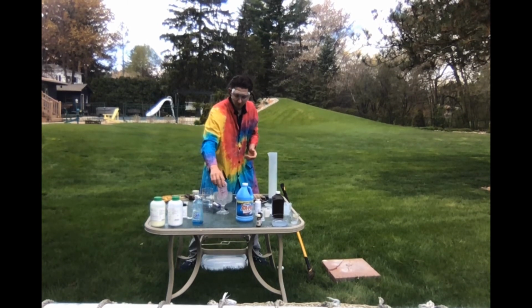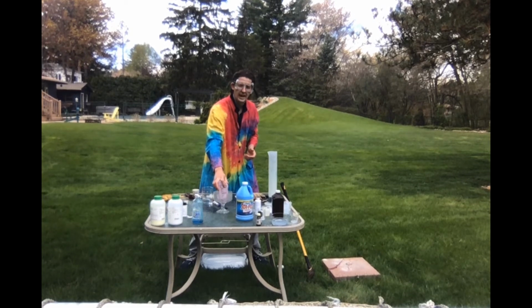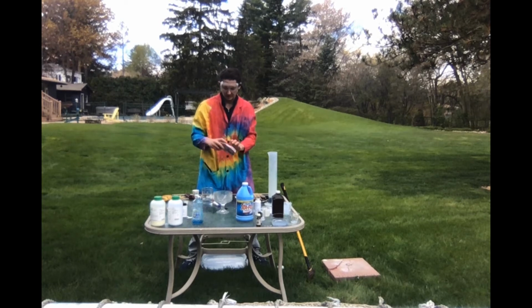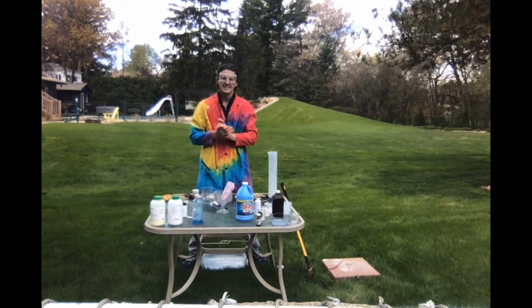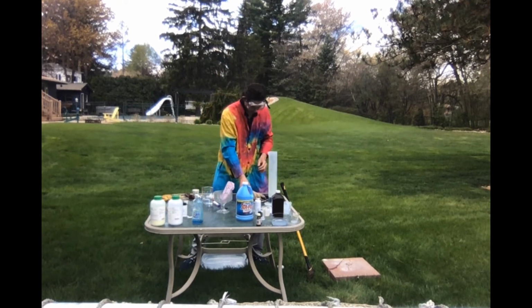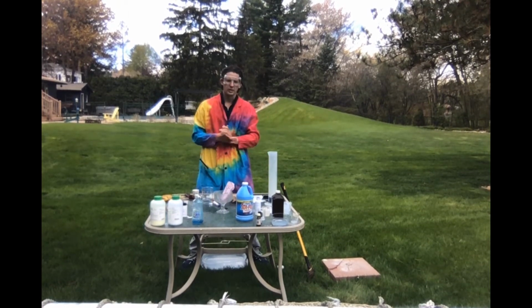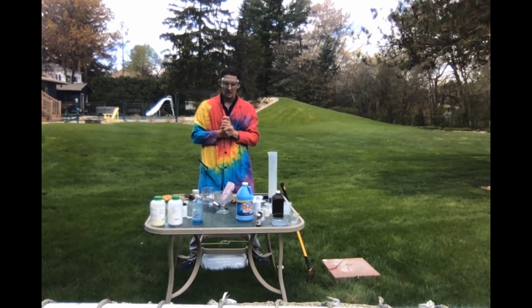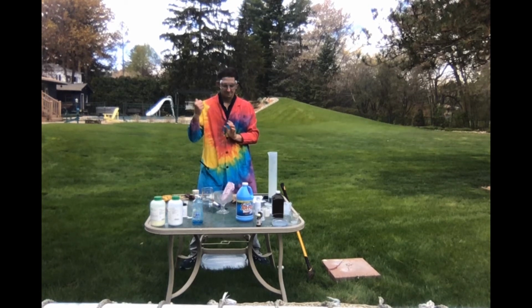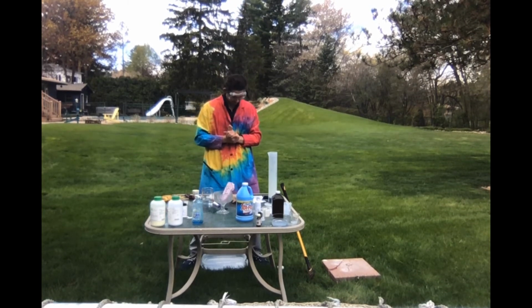The styrofoam is going to dissolve in the acetone because styrofoam is made of mostly air. It dissolves and becomes kind of a silky or slimy substance. Hopefully I'll show you how that works. It's a pretty easy demo, and I believe you guys have seen it anyways, back in the beginning of the year, around Christmas time.